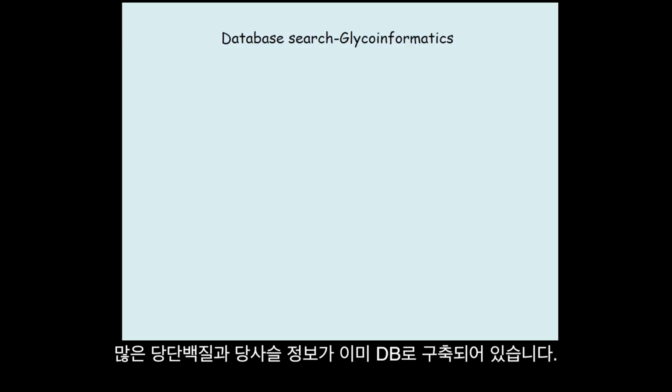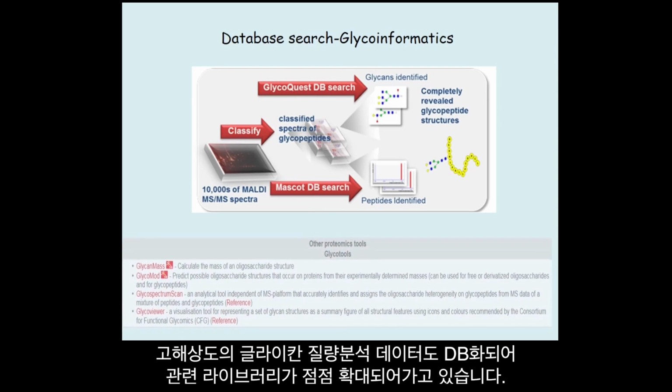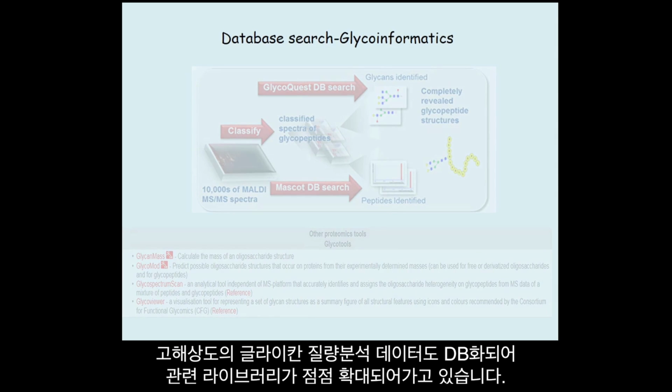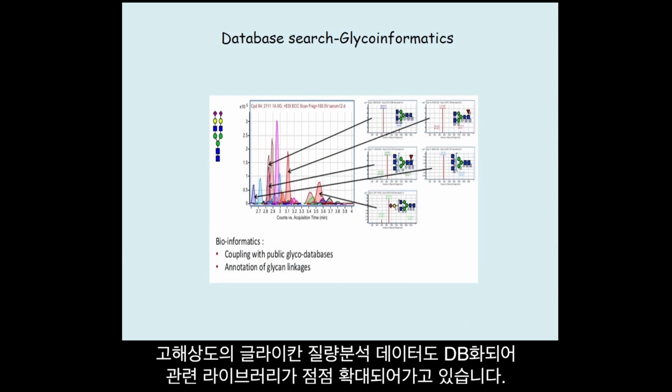For glycoprotein and glycopeptide sequence analysis, a large number of well-characterized and annotated glycoproteins are commonly found in the UniProt knowledge base. Many glycopeptide mass spectra are also expanding the PeptideAtlas library, which stores millions of high-resolution peptide fragment ion spectra acquired from a variety of biological and clinical samples for peptide and protein identification.